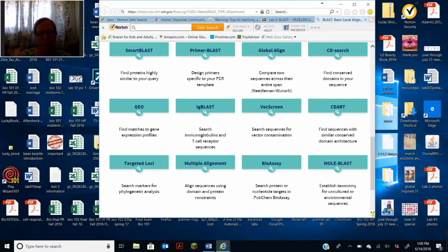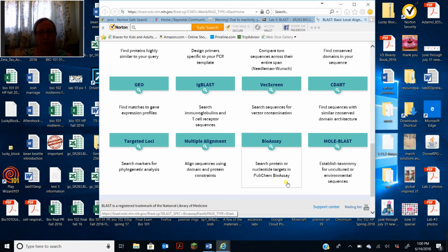There are all kinds of things that you can do in here. Here's the tree. Let's say that you have a marker for a certain gene. You're looking for cystic fibrosis. Maybe you're trying to study it. You're trying to see how far it goes back. You're studying pedigrees, family trees. The list is very long.